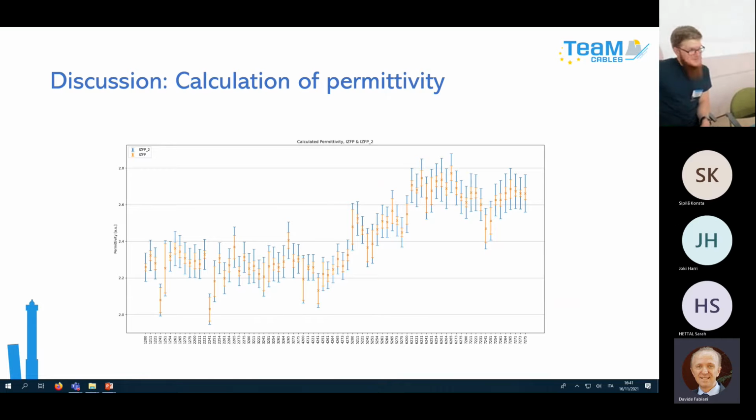The first thing you can notice is that the later values are for materials 5, 6, and 7, the materials with ATH. So again, ATH is very well detectable, but aging effects, let's say for samples of modification 1, are not really detectable in this case. Modification 2 and modification 4 are in the same area, again with these big error bars.